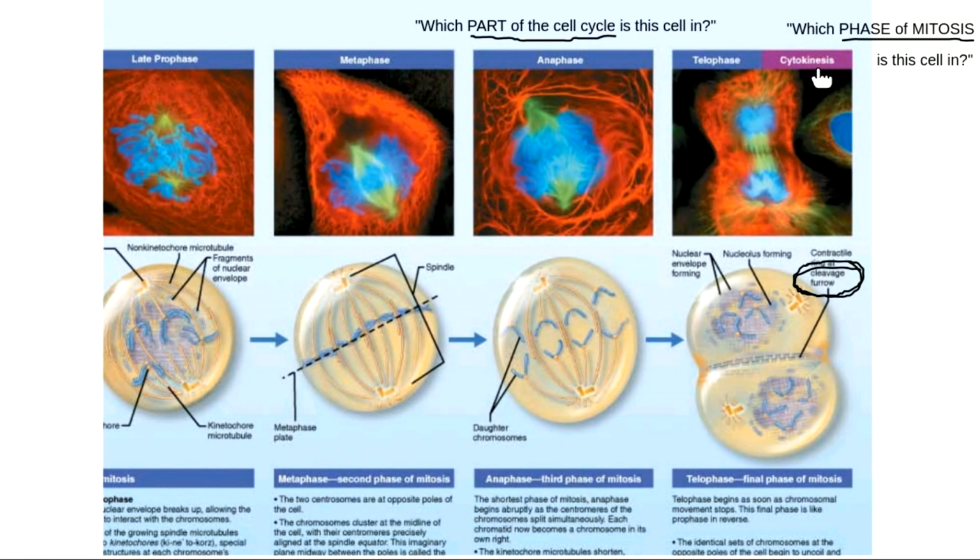I also have a question on the slides. Are we looking for a specific part of prophase or just prophase in general? You're just looking for prophase in general. We're never going to ask you to specify, is this early prophase or late prophase? But along those lines, you do need to be able to identify prophase with either of them.